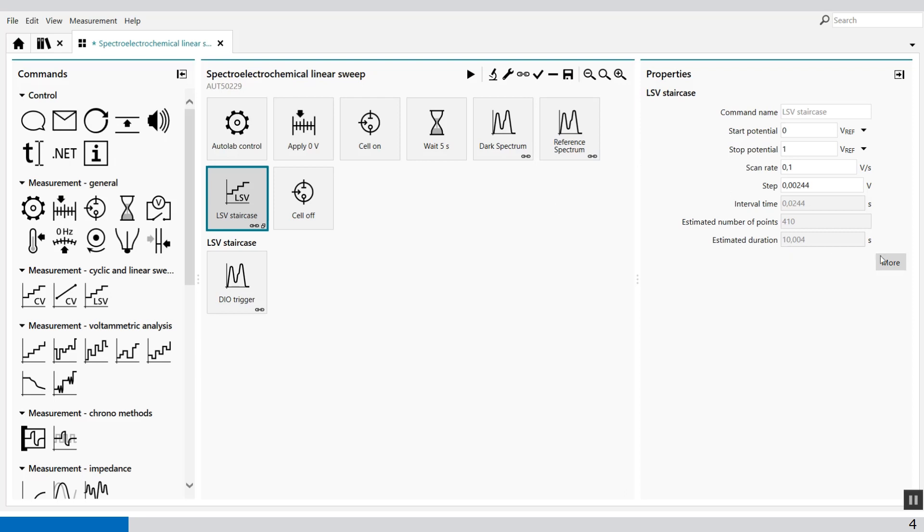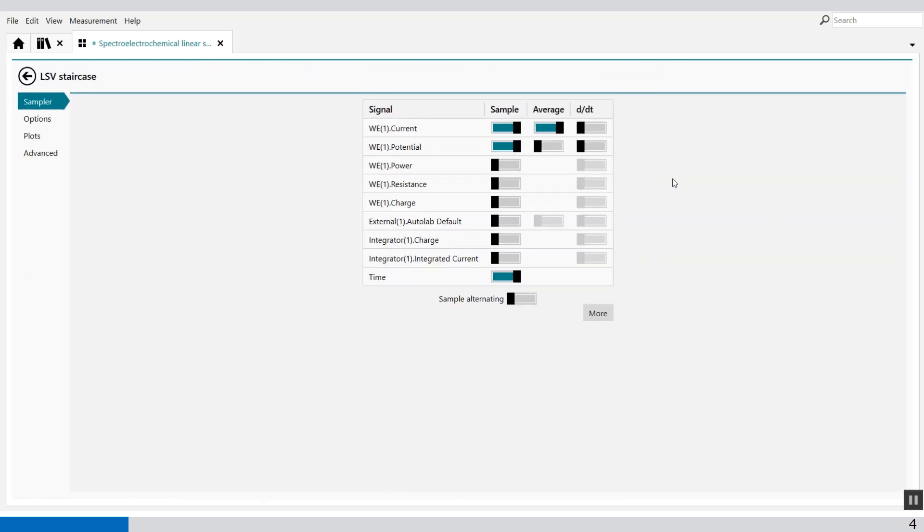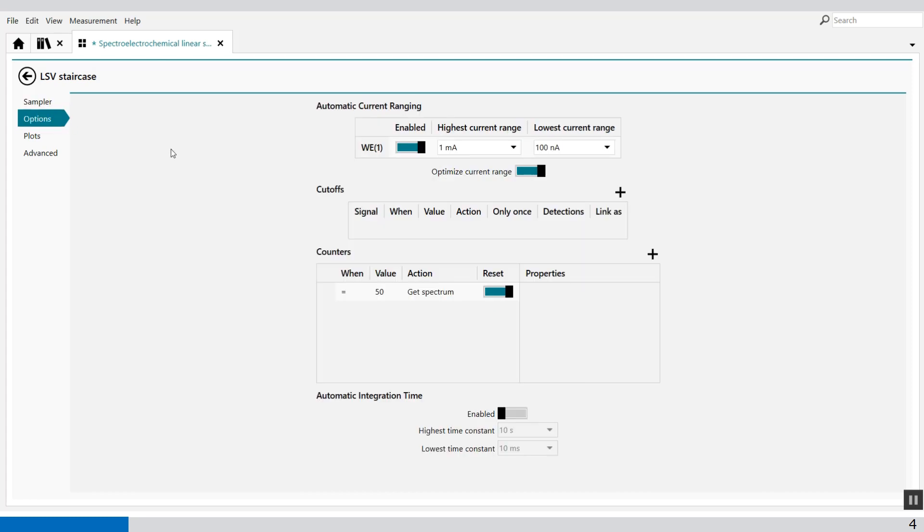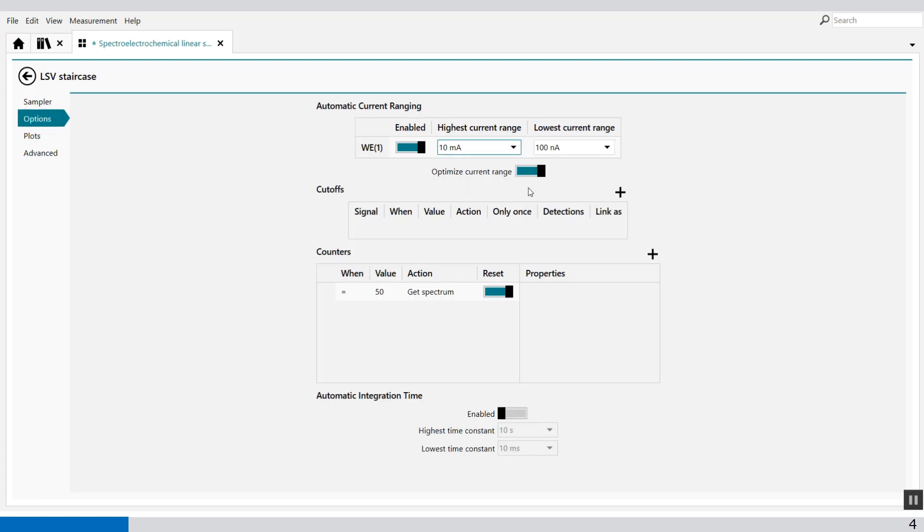In the more button you'll see what we sample. We're sampling the current and the potential. And in the options you can select the highest current range let's say 10 milliamp and to the lowest current range of 100 nanoamps.